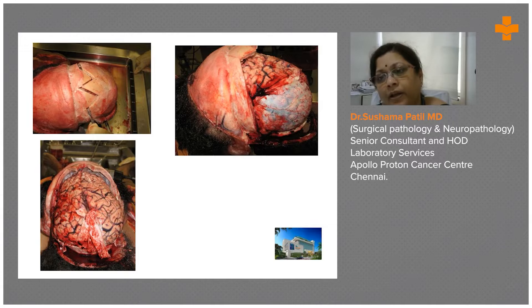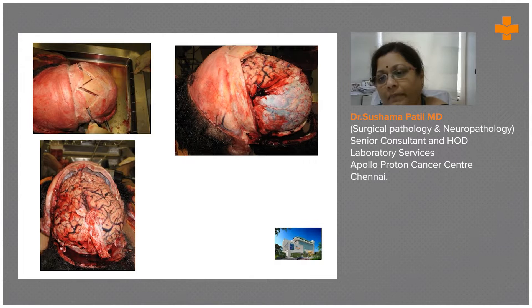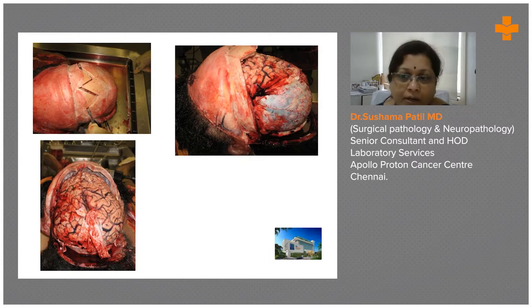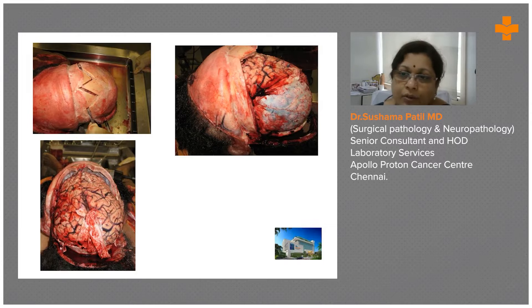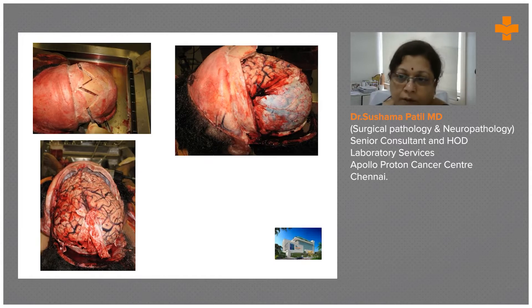Part of the dura is already peeled and you can see the underlying brain tissue. You can also see the middle meningeal artery coming into focus — it's a very tight compartment. Rupture of this middle meningeal artery will give rise to extradural hemorrhage. This is how the brain looks in-situ at the time of brain autopsy.